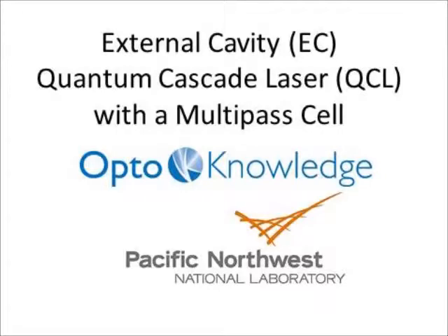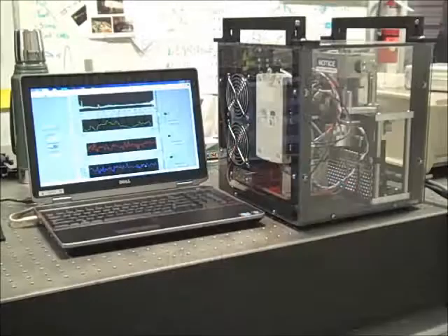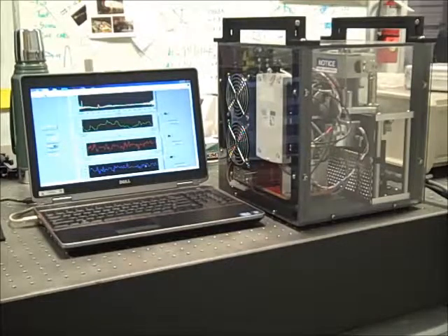In this video, we demonstrate an eCQCL multi-pass system designed for real-time trace gas analysis. In one of our other videos, we actually give more details on the technique, as well as the specific system shown here.